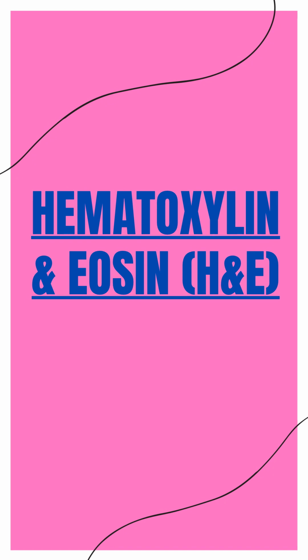As a basic dye, hematoxylin carries a positive charge, and it selectively binds to acidic components in the tissue, particularly to structures rich in nucleic acids, such as cell nuclei. Eosin, on the other hand, is an acidic dye and binds to basic or eosinophilic components such as cytoplasm. As an acidic dye, eosin carries a negative charge, and it tends to bind to positively charged or basic structures in the cells or tissues.